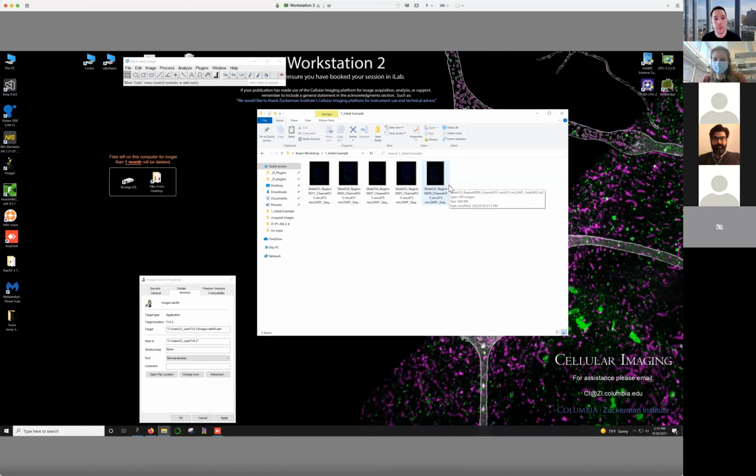you should alphanumerically label those images. So if it's from the spinning disk or a point scanner, usually you're marking out those tissue sections anyway. So just make sure that you mark them in an anterior to posterior order, and then you'll be fine. For the slide scanner, because it's such a regular system and we don't have control over which sections it images in any particular order, we just read in the coordinates from the files, and that way we know where they were on the slide. And so if you're using the slide scanner, the ordering will happen automatically.